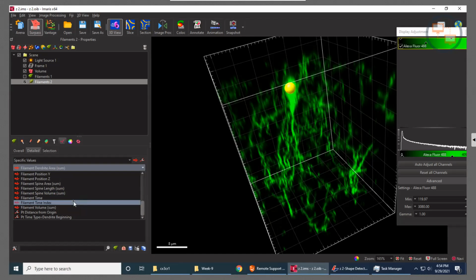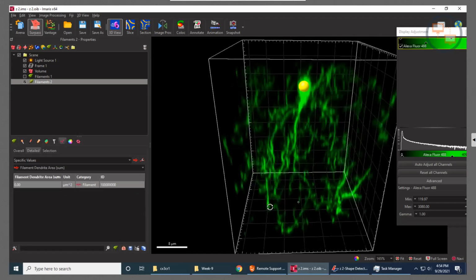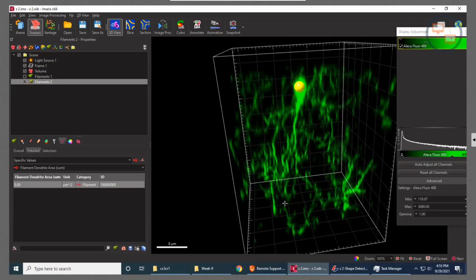So it's a lot more flexible that way. Unfortunately, you might have to deal with some stuttering or a reduction in apparent quality when you're working remotely. You might have seen once or twice the entire volume we were looking at was spinning, because that is a result of the latency in communication.